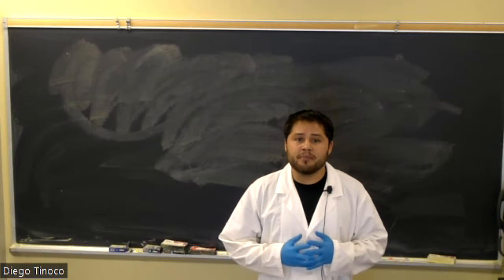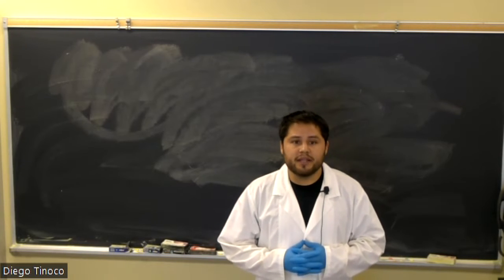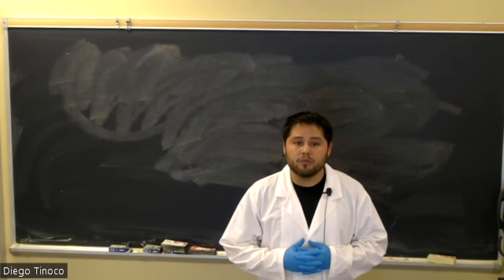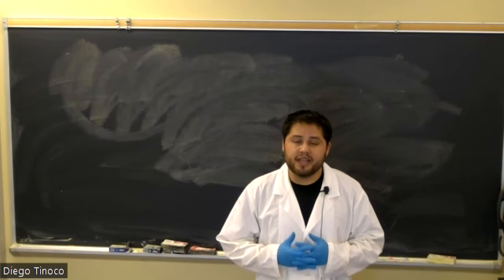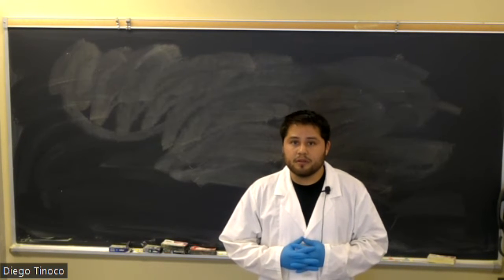And right about now, you might be wondering why slime? As a college student, well, now we will dig deeper into what happens chemically when making slime. In this four-part lab experiment, starting with part one, we will see how properties of our polymer strands change when reacting with our cross-linking agent, creating our slime.